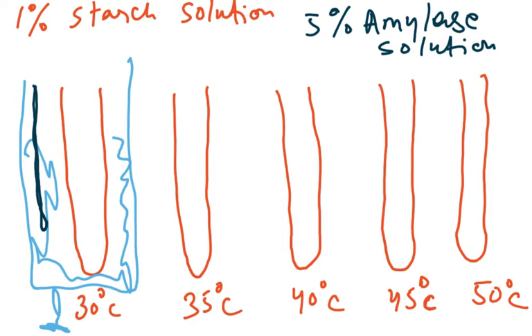So a beaker, this is indirect heating. This is a beaker with water in it. At times we give you hot water to put in it so that it doesn't take a lot of time to heat. And then there is a thermometer in it to maintain the temperature so that you can see how much the temperature is. Is it going up? Is it going down? So we will adjust the flame of the Bunsen burner, or we'll close down the Bunsen burner, to maintain the temperature at 30 degrees Celsius.